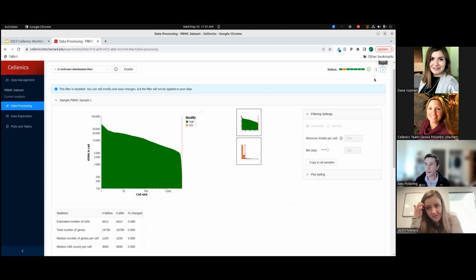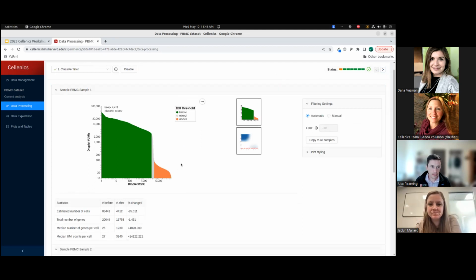Alex, sorry to interrupt. I'm on one of the burner accounts, and my graph looks different from yours. I don't have a gray bar at all.